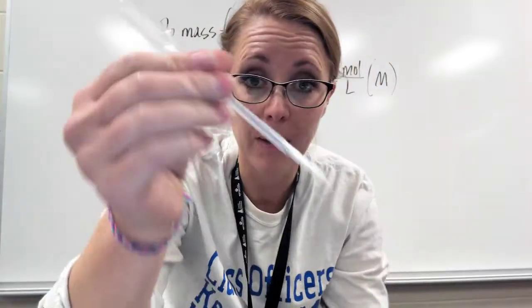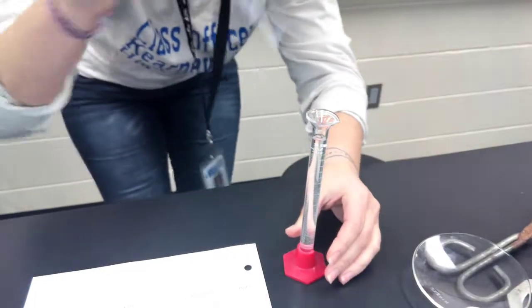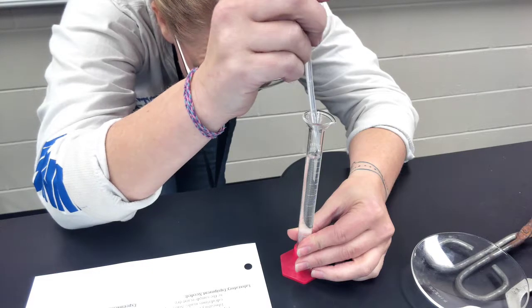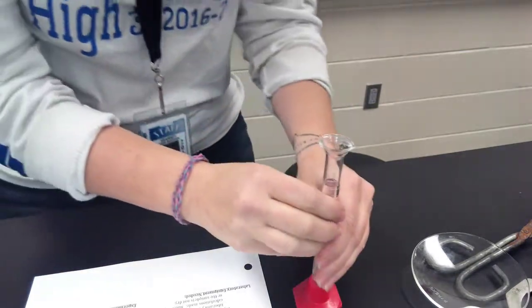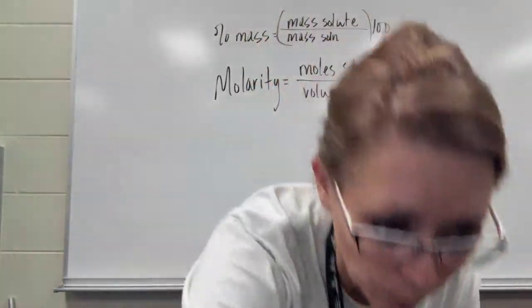Then get a pipette from the back cabinet. Go to your lab station. Put your glassware onto the counter. And what you're going to do, squeeze the pipette bulb, place it into the graduated cylinder and remove liquid until you get to 10. Ta-da! Put the salt water excess into the sink. Not a big deal. And now I have exactly 10.0 milliliters of my sodium chloride solution, and everyone isn't waiting for 5 years for me to be the perfectionist that I am and get exactly 10 from the fume hood. So I have my 10 milliliters of sodium chloride solution.